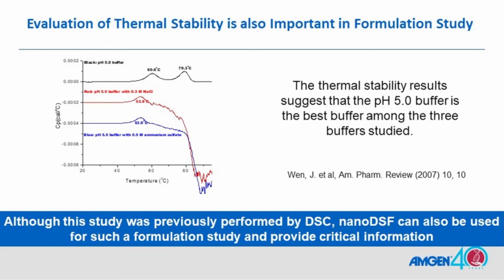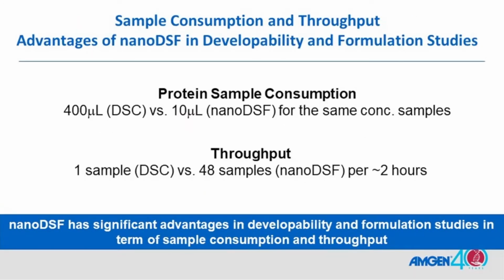Once again, although this study was previously performed by DSC, nanoDSF can also be used for such a formulation study and provide critical information.